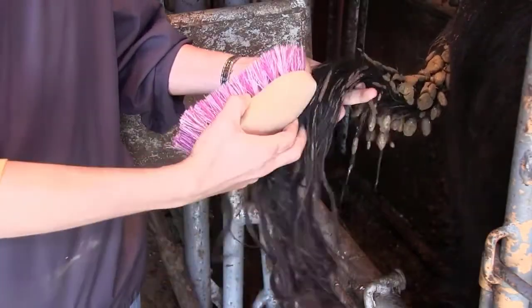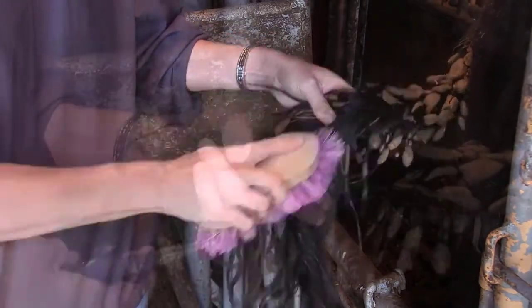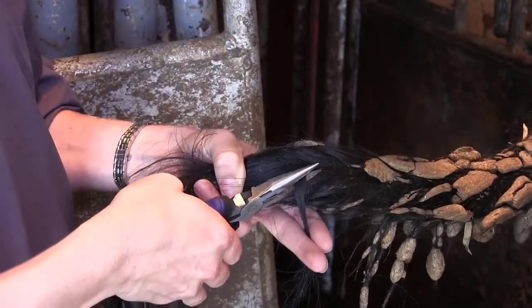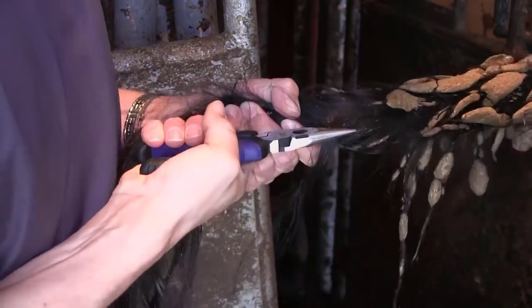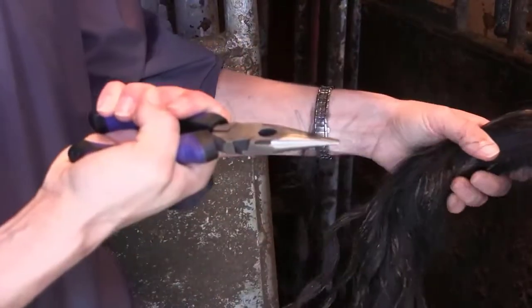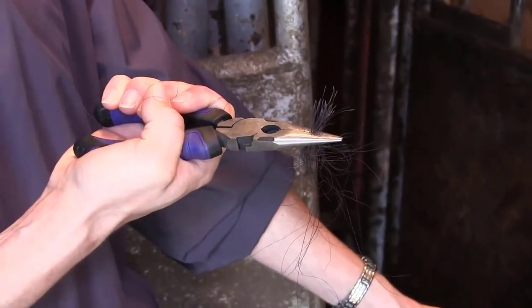First, if the tail switch is dirty, use your brush to remove dirt and other contaminants. Make sure the area is dry before collecting hair. Use bent nose, long nose, or needle nose pliers to pull the hair. Place the pliers close to the tail and pull the hair directly away from the animal, not at an angle. This will allow the root to come out with the hair.